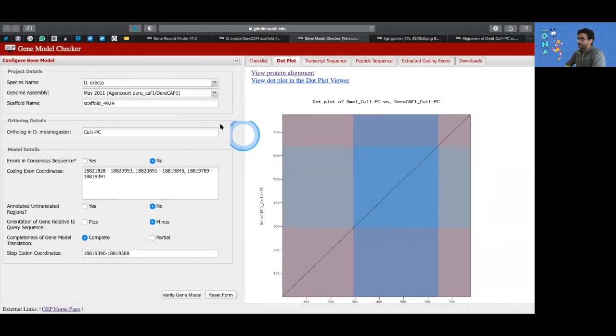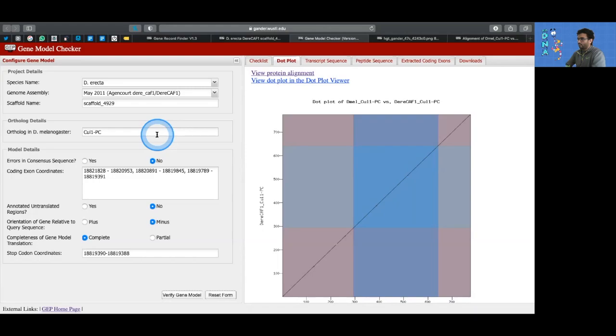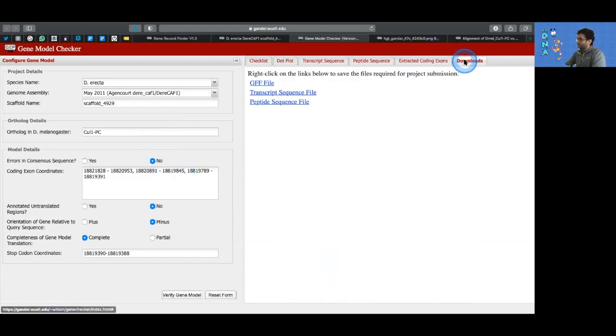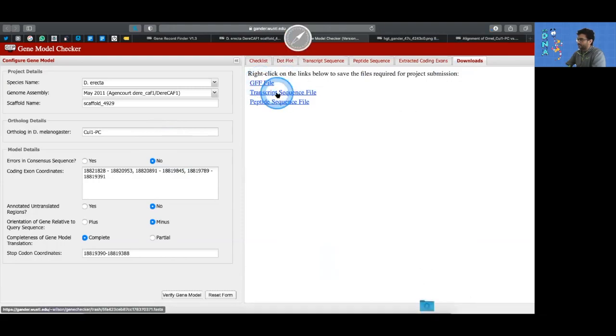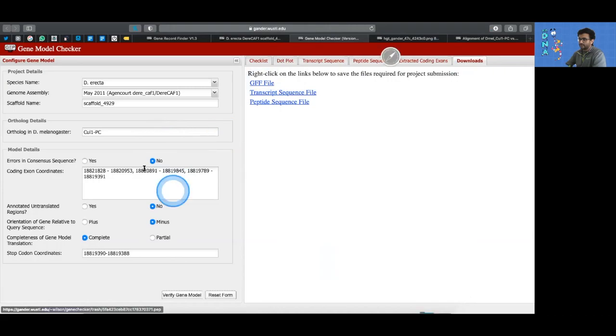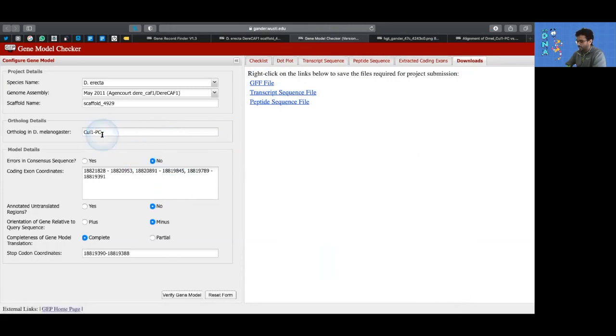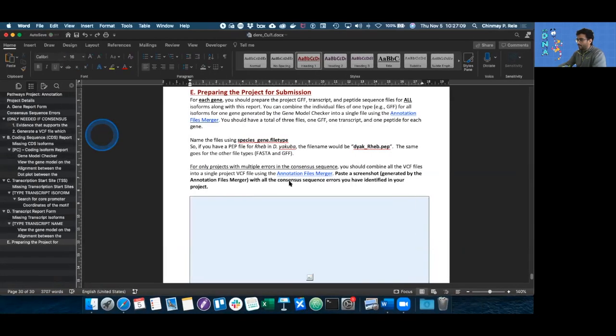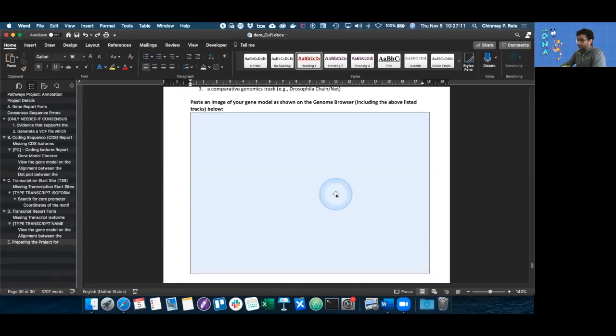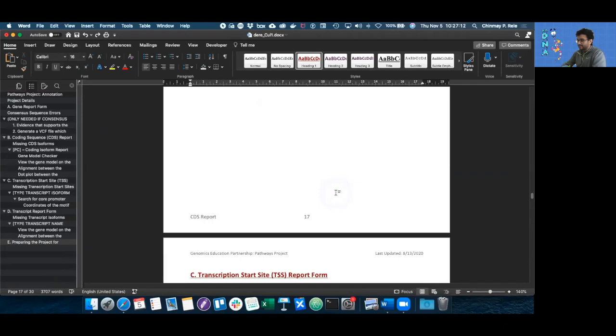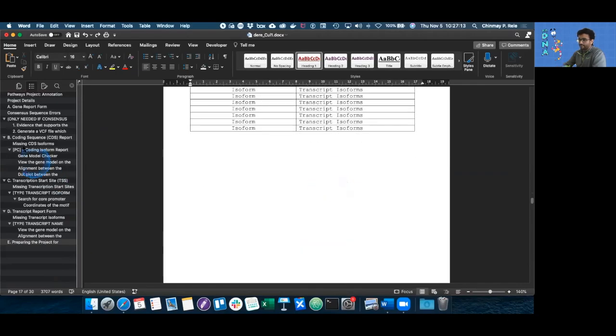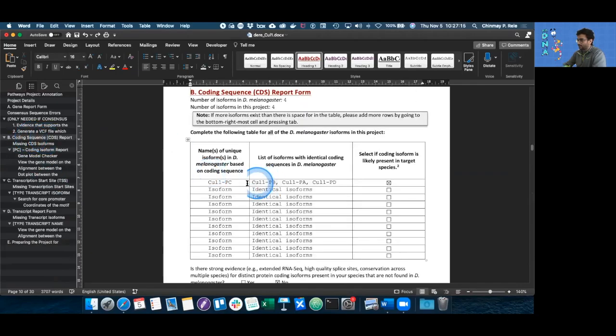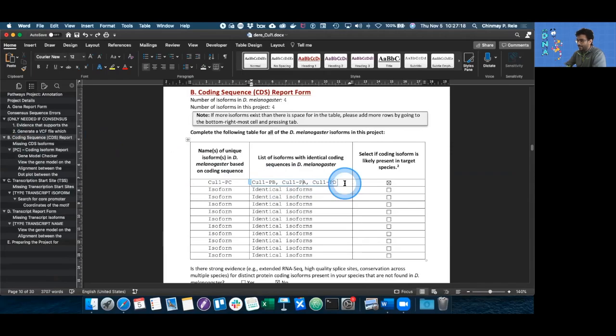If you remember last time, I told you not to close the gene model checker because that's what we start off with. So we go to the download section and we download the GFF, the transcript sequence and the peptide sequence file for the PC isoform. We also need to download all of those three files for every other isoform: the B isoform, the A isoform, as well as the D isoform.